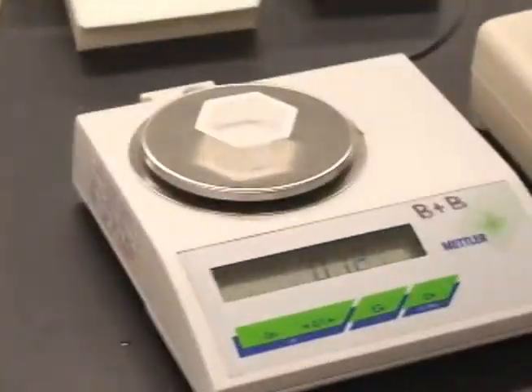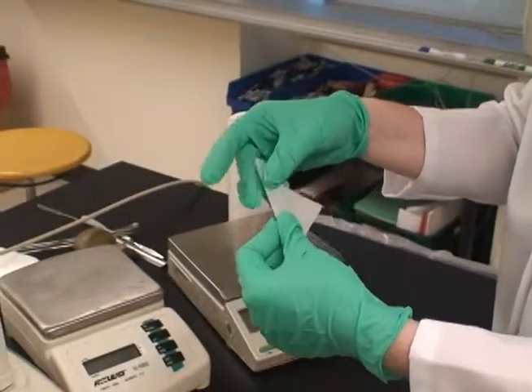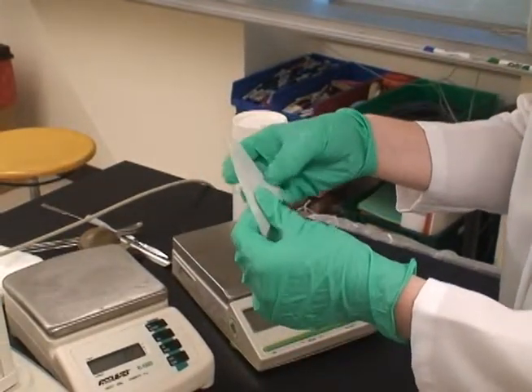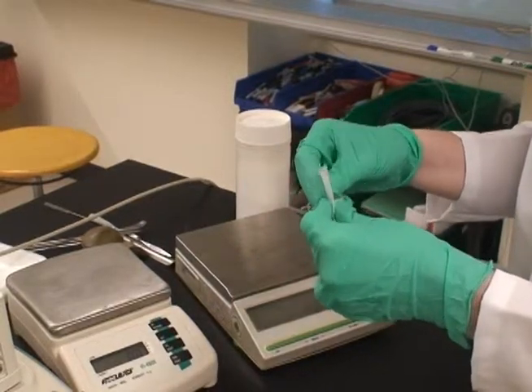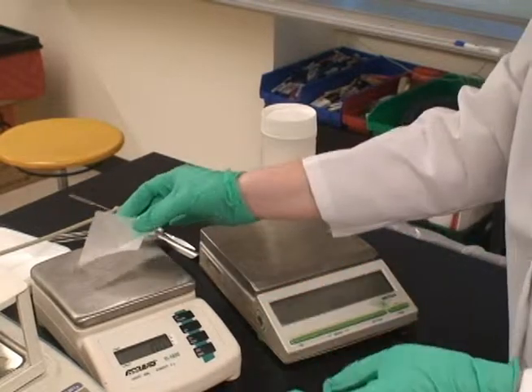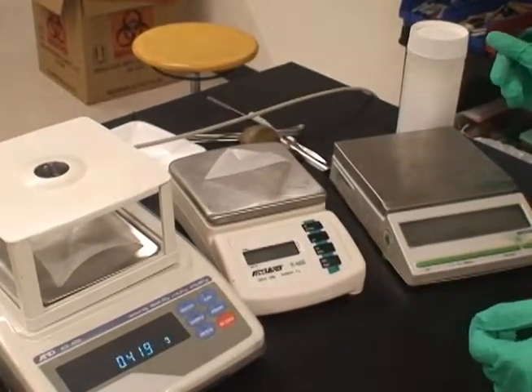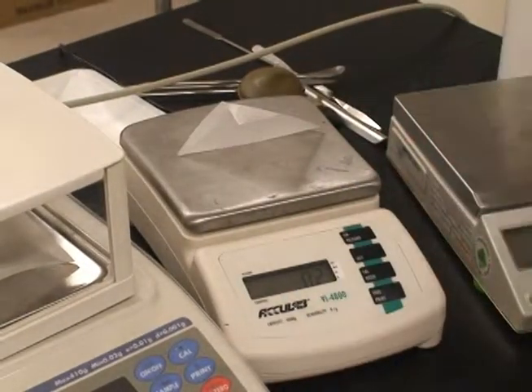While working with weighing trays or boats is fairly simple, working with weighing paper requires that you do some folding. The folding, like so, ensures that you will be able to get whatever you're putting onto the paper off of the paper, and successfully into whatever you're measuring it into.